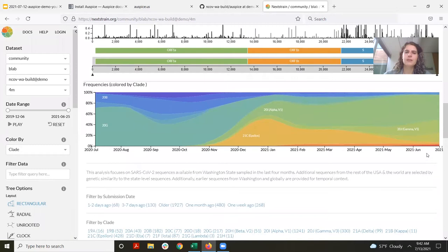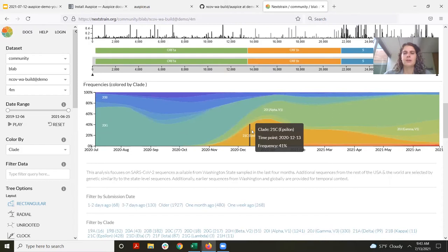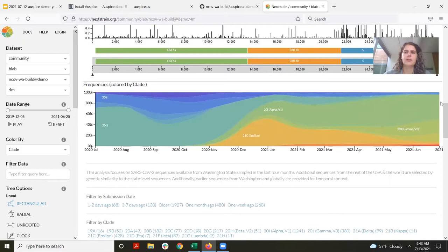Our final panel is the frequencies panel, which shows the calculated frequency of whatever you're coloring the tree by — in this case clade — on a weekly basis. So here it is December 13th, then the next week and the next week and so on. This panel is really useful for looking at time trends within the tree.